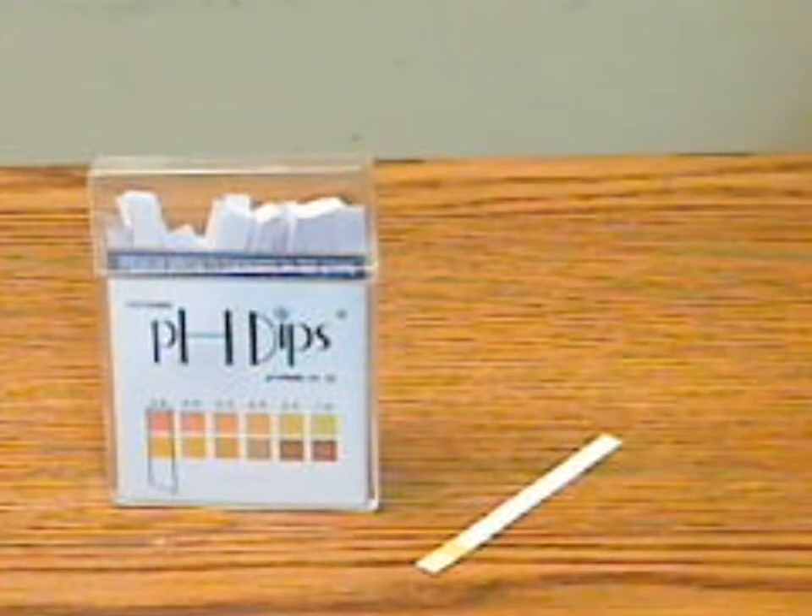You get a good range of what your pH level is for whatever you're testing. These are good if you don't want to mess with calibrating a digital pH meter and you just need a quick reading that gives you a pH range — such as with an aquarium and that kind of thing. Then these will do the job.